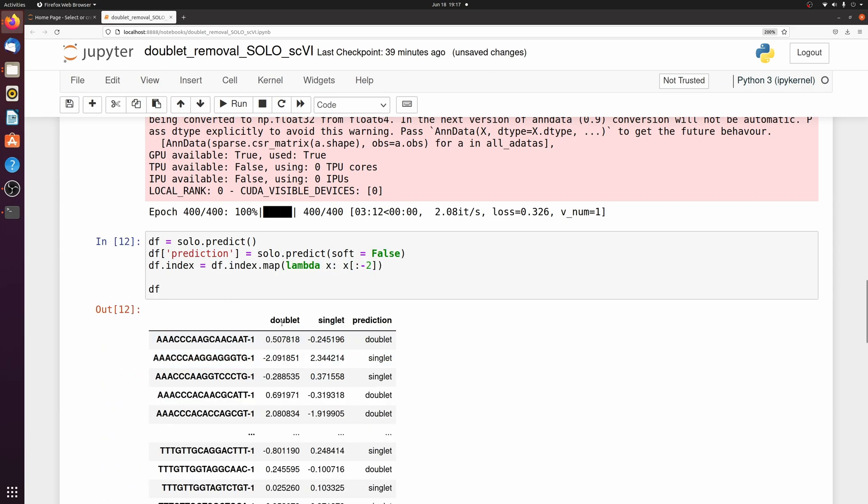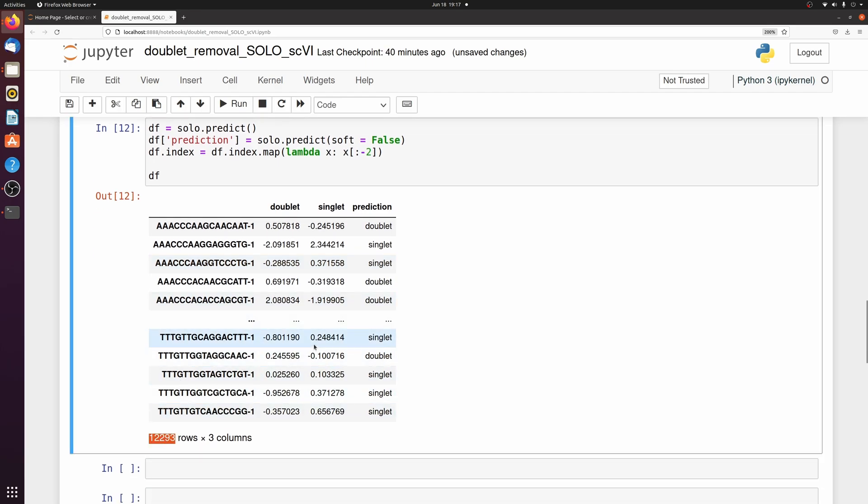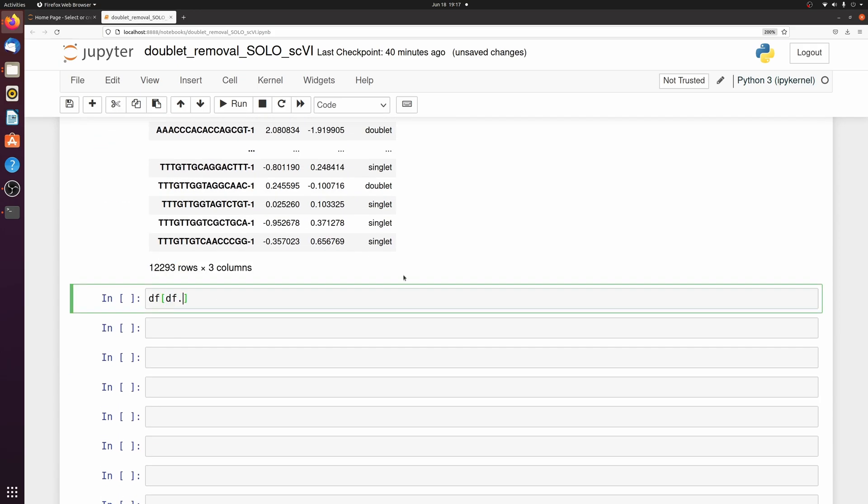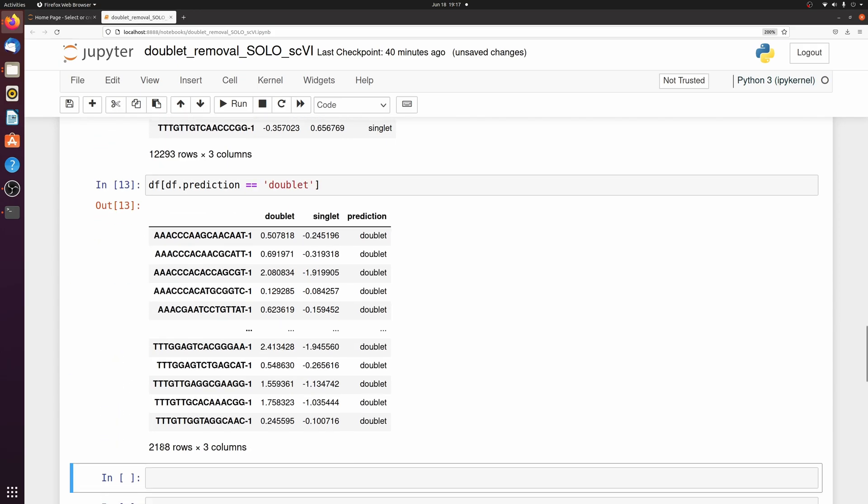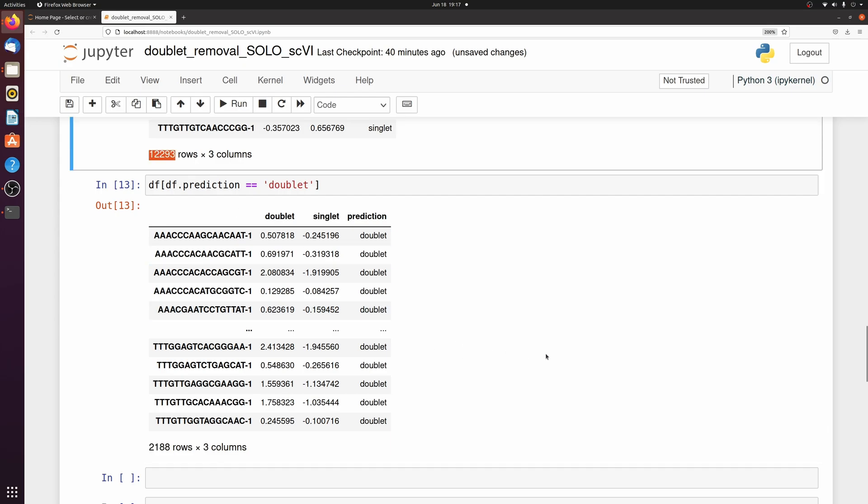All right, anyway now that that's gone, let's see how many out of these 12,000 cells were actually called doublets. So it predicted almost 2,200 doublets out of the 12,000 cells. So there actually is a pretty high doublet rate.